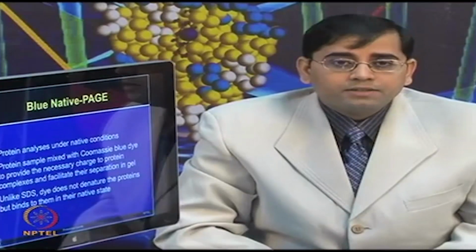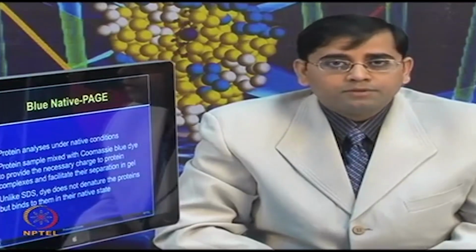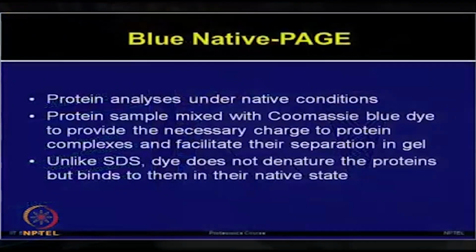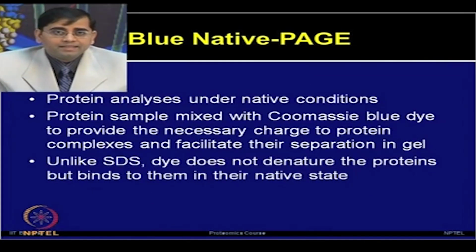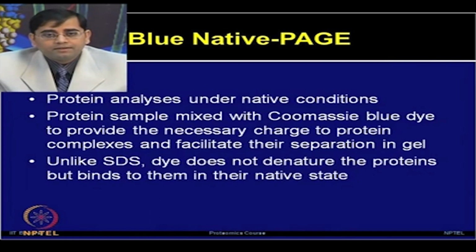So, in the blue native PAGE the protein analysis is performed under the native condition. Here you are not going to boil your protein sample with SDS and provide the different types of denaturing condition. So, you need to add to the sample Coomassie dye, which provides the necessary charge required for protein complexes to separate in the gel. But as I mentioned, unlike SDS, this dye will not denature the proteins, but it will bind in their native state itself.